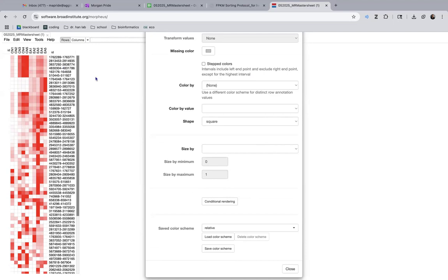Really that's enough for this first presentation, because what you're gonna show is that there's a clear difference between the normal tissue samples and the European triple negative breast cancer, and also the normal tissue African American and the African American triple negative breast cancer. So then we're going to close this, and this gives you a clear distinction of the differences within the samples.